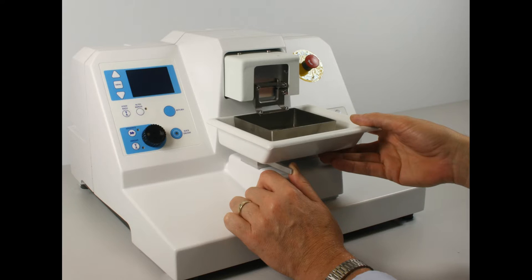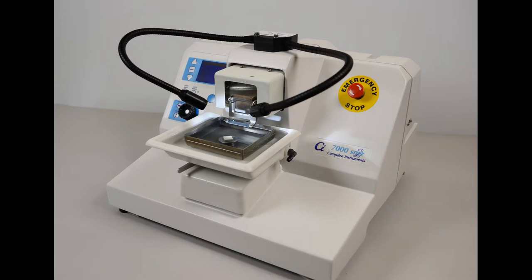With this slicer we use titanium for the blade holder. Titanium is approximately one half the density of steel and has other significant advantages. It is unaffected by ACSF and does not rust.